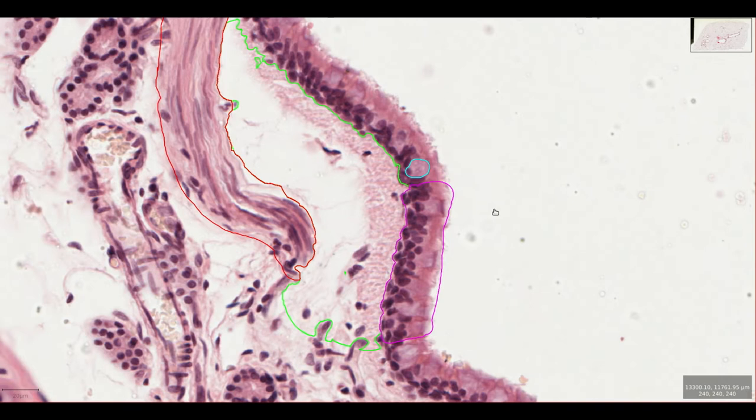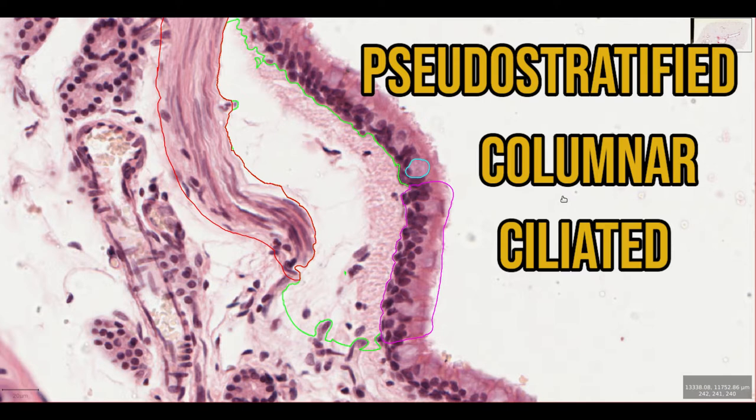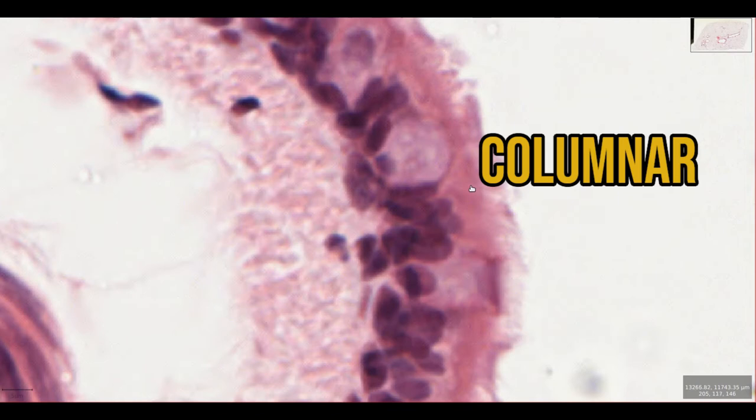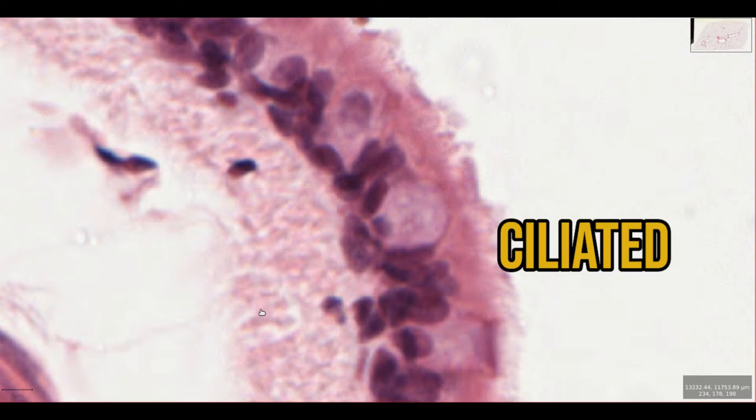The epithelium here is pseudostratified, columnar and ciliated. Pseudostratified refers to the fact that the nuclei of cells are at different heights and positions, giving the appearance that there are multiple layers of cells when in reality the epithelium is only one cell thick. Columnar refers to the shape of the cells — they're tall and elongated. And lastly, most of the cells are ciliated, and we can see the cilia as these tufty projections from the apical surface of the cell.